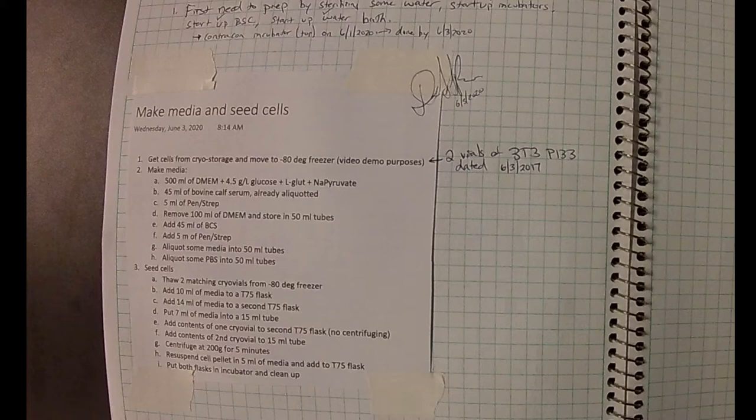It's a little different when working with teammates as well versus working by yourself. For instance, working with teammates, it's really nice to have somebody there to read the steps to you and who can be taking notes. Who can have their computer in their hand and not worry about contaminating it with cells because they're not touching the cells. The person who's doing all the work in the biological safety cabinet is touching the cells.